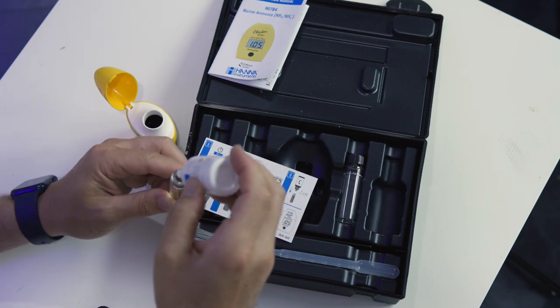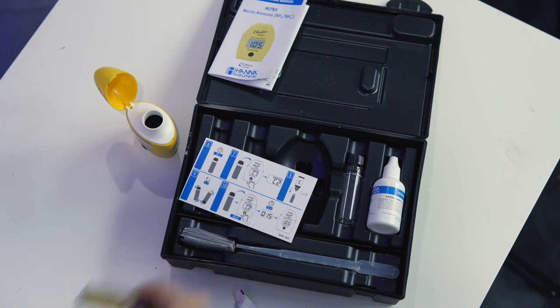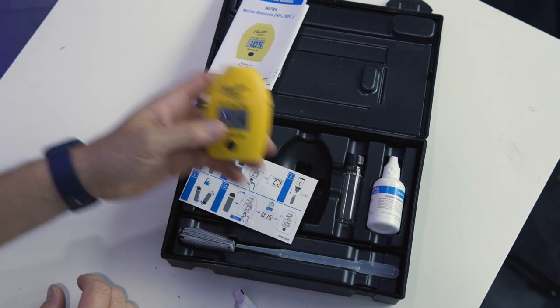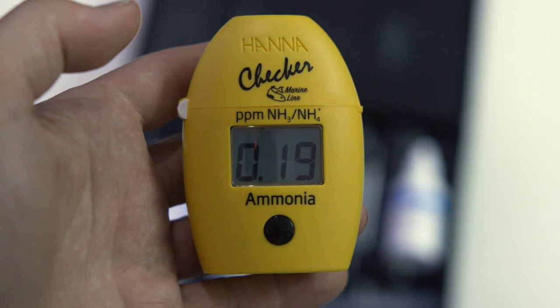Next, add 12 drops of reagent B. Invert the vial 5 times, return the vial to the checker, and press and hold the button to start the 15-minute timer. Yes, you heard me right — 15 minutes. Fifteen minutes later, a result without the need of looking at a color card. Should I be concerned that there is ammonia in my fully cycled thousand-gallon reef tank full of fish? Nope, not at all.